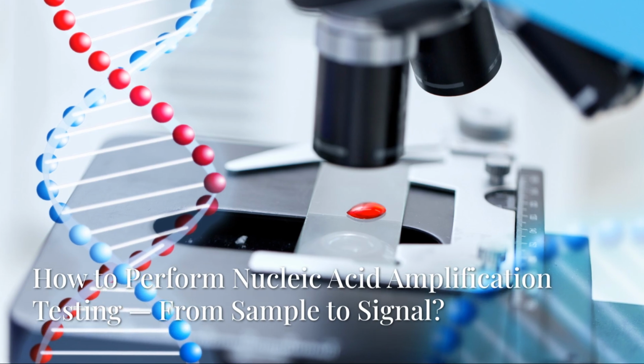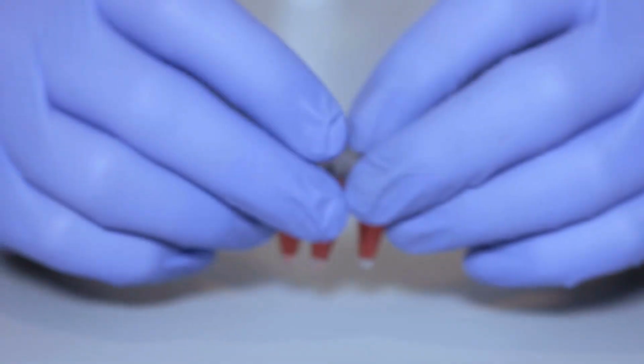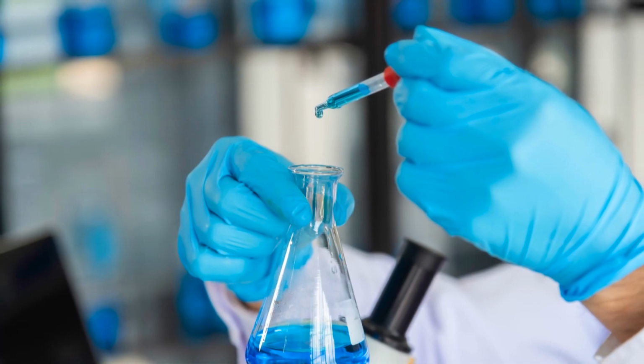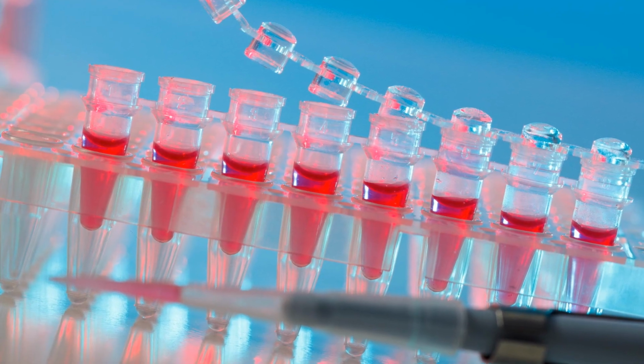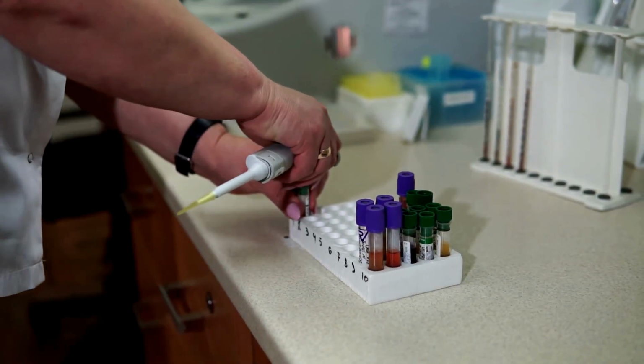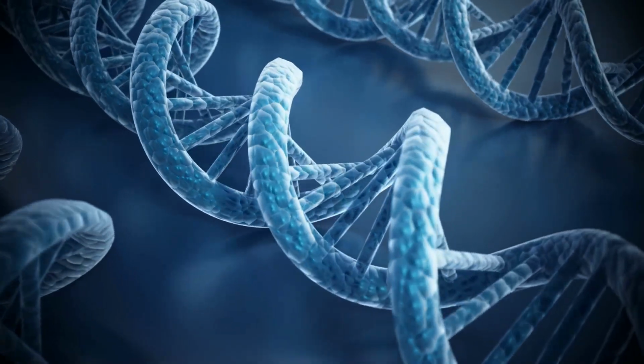How to perform nucleic acid amplification testing, from sample to signal. Let's get practical. First, prepare your nucleic acid sample. Ensure it's pure, free of inhibitors, and properly quantified. Next, set up your reaction mix: template DNA or RNA, primers, nucleotides, buffer, and the polymerase enzyme.